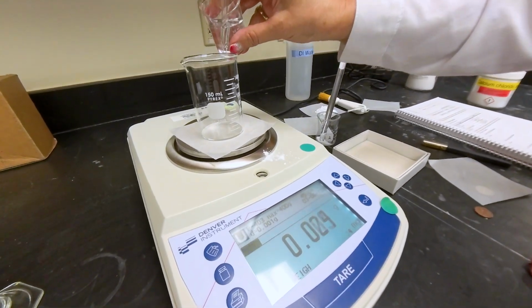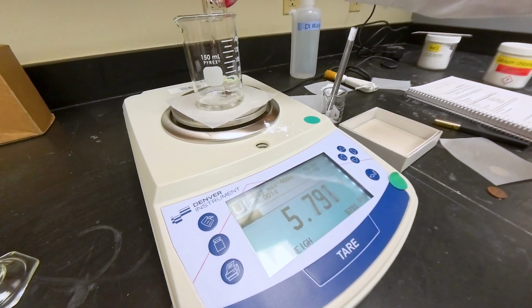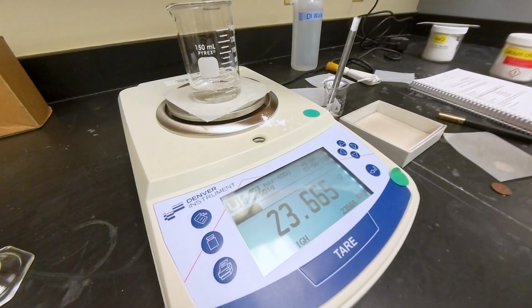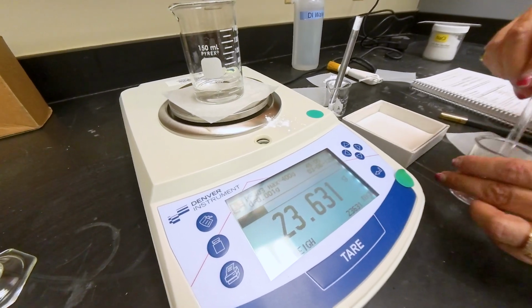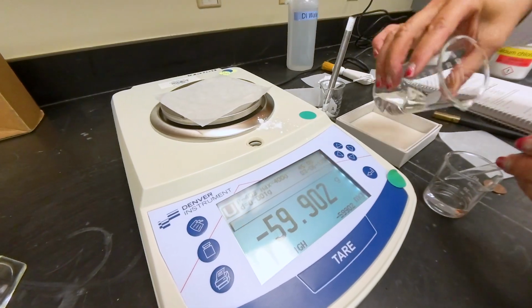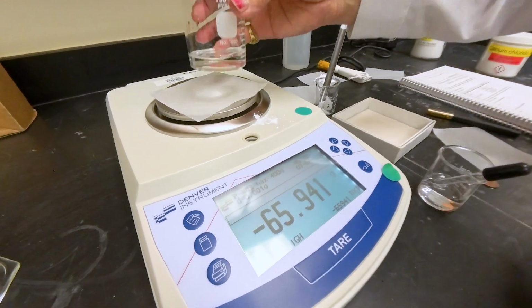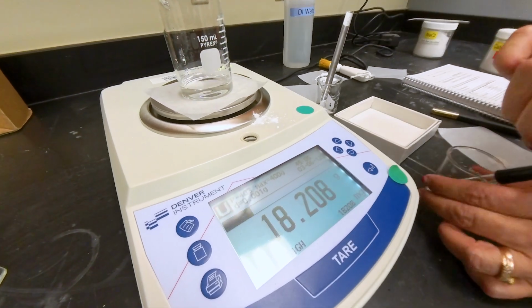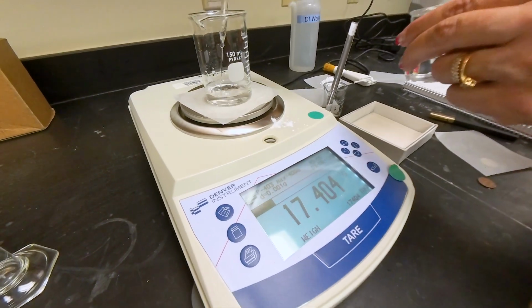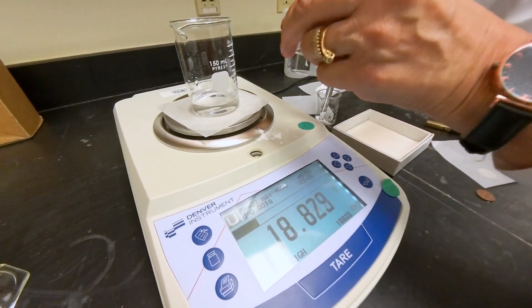Carefully, without spilling the water on the scale, add enough to get close to 22, and then the last part should be adjusted with the dropper. By pouring, it may not take you to that exact number, but if you get close to 22, then use a dropper to adjust the mass.